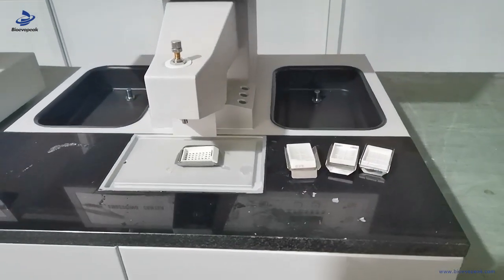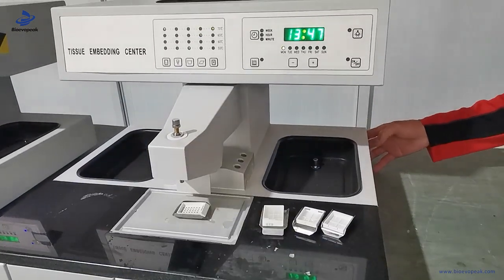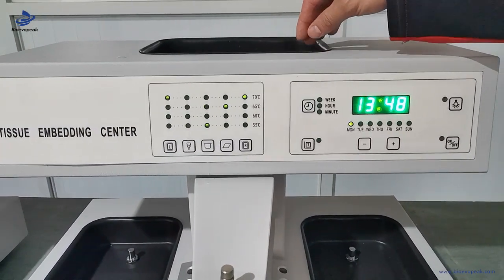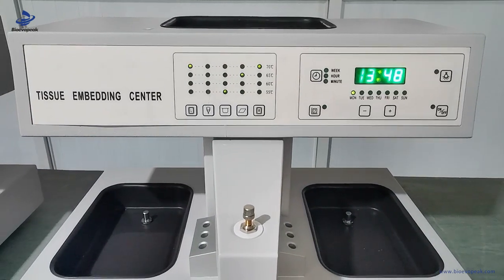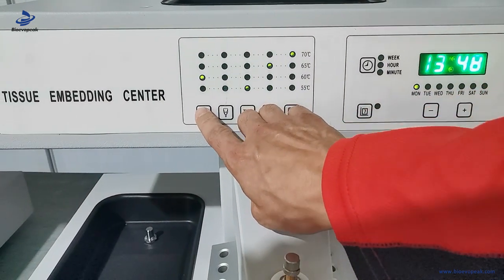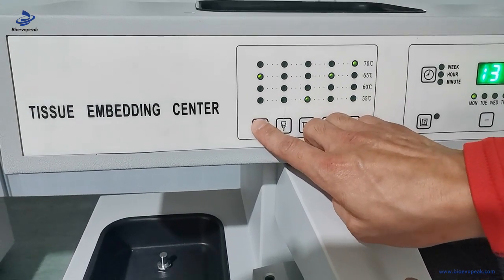Now let's introduce how to start the machine. Firstly, put the paraffin block in the paraffin station. Then we adjust the temperature of the different parts. The left heating box temperature is from 55 to 70 degrees.